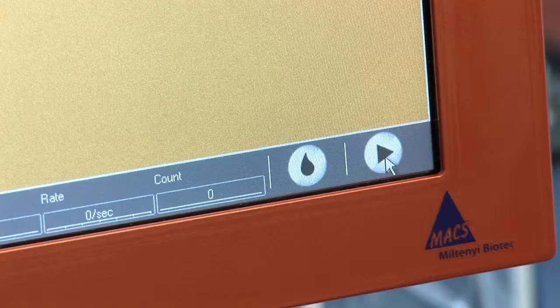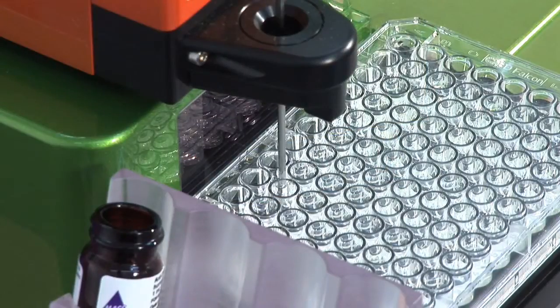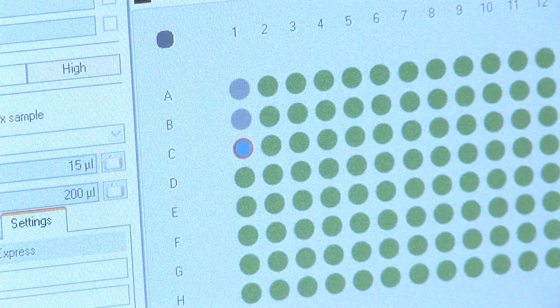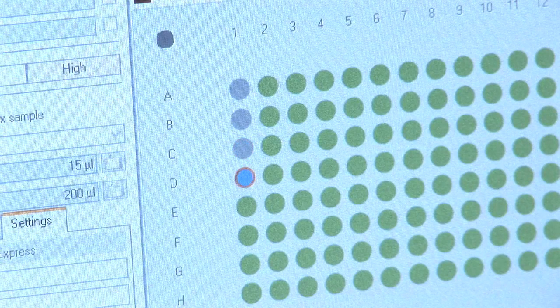Press Start measurement. The MaxQuant Analyzer will automatically process all 96 samples as instructed using the data analysis window that you have selected.